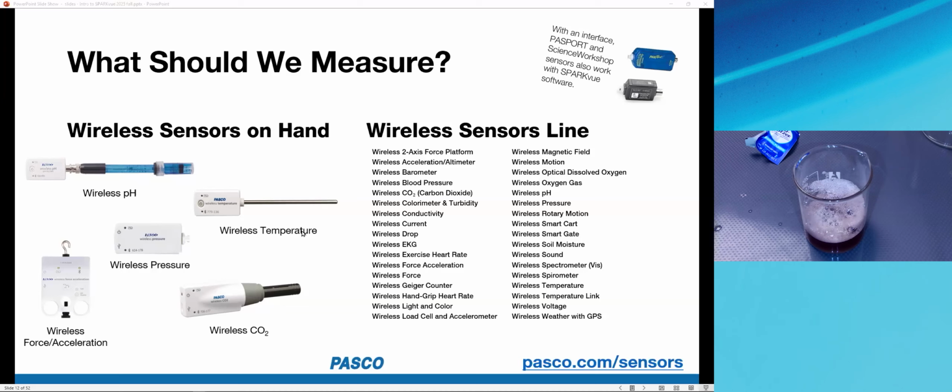So thanks for your questions. Darren asks, is this exothermic or endothermic? Yeah, that's a question we might be able to address with the wireless temperature sensor. Mamta says CO2 wireless. Yep. Francisco asks CO2 detector.